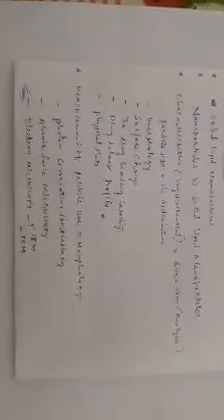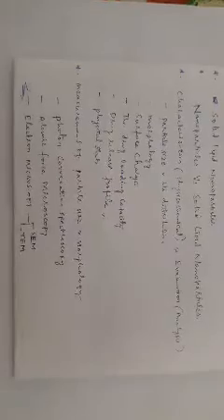During my discussion, instead of saying dynamic light scattering, I will just say DLS, and instead of saying electrophoretic light scattering, I will say ELS. So DLS measures the size distribution of molecules and particles, whereas ELS measures the electrophoretic mobility of particles or molecules in the dispersion or solution. This is often converted to a zeta potential.